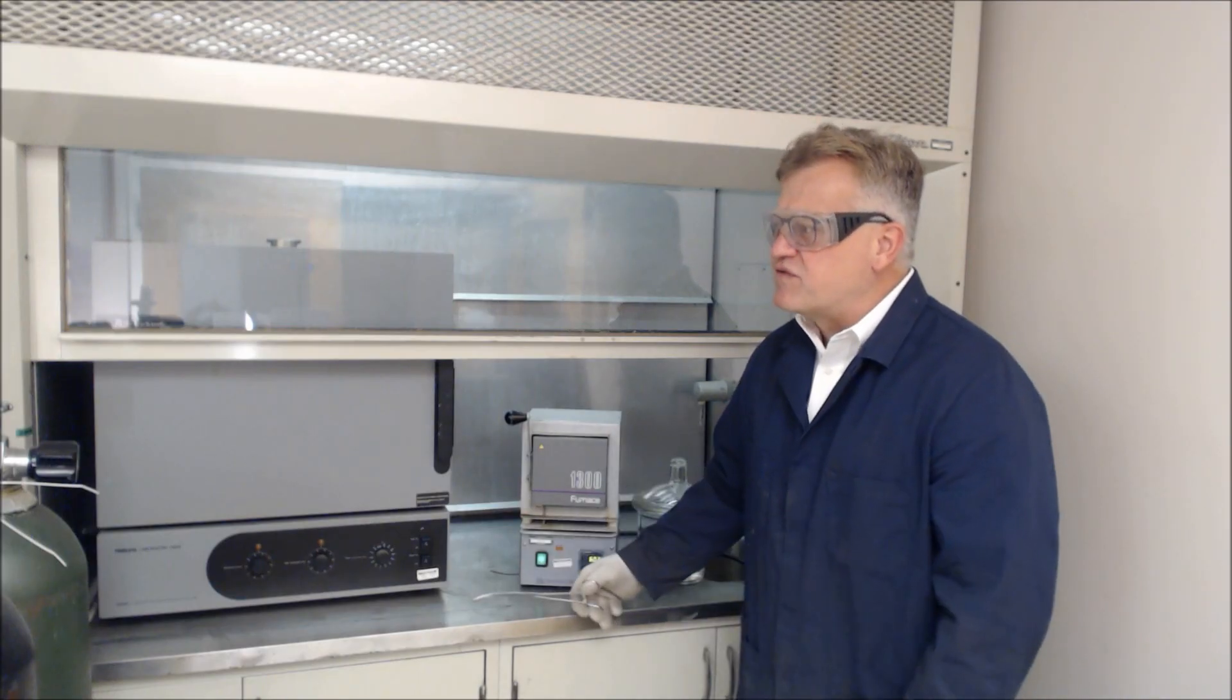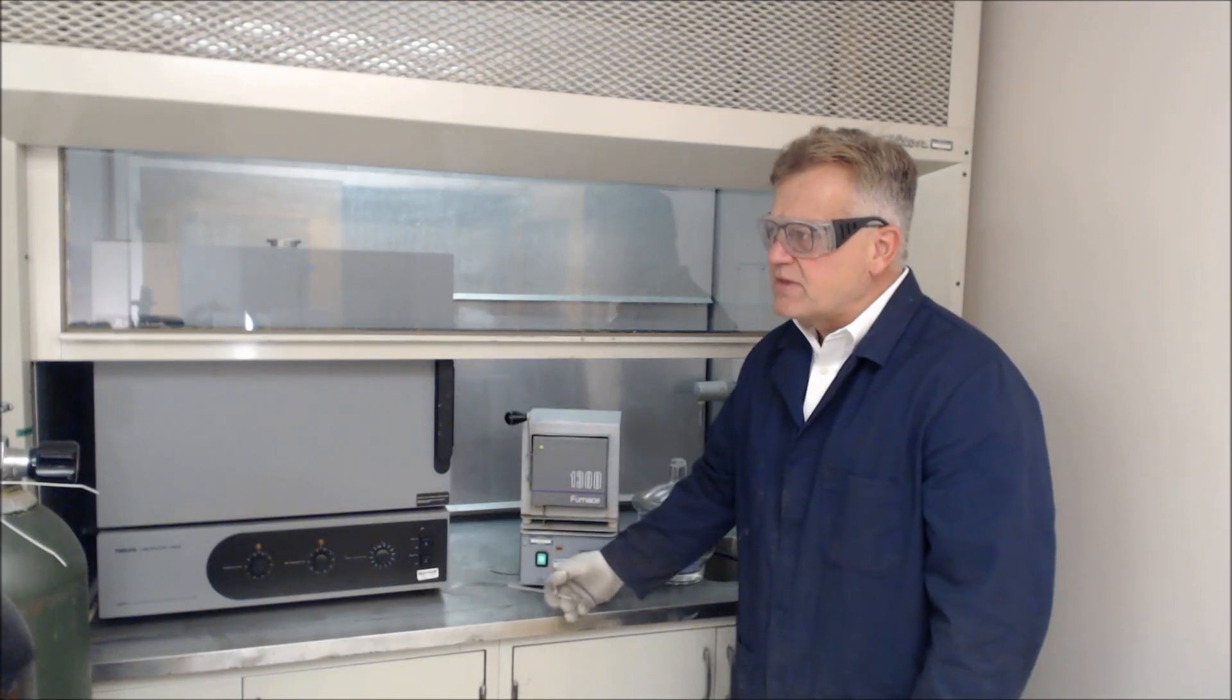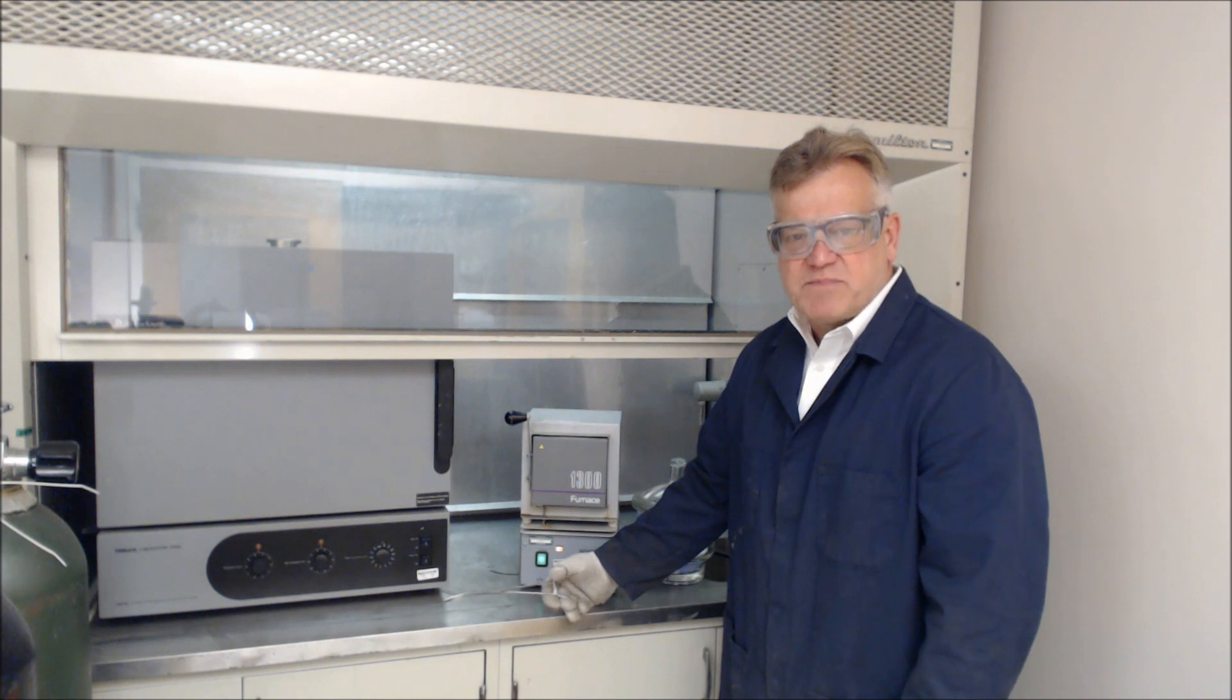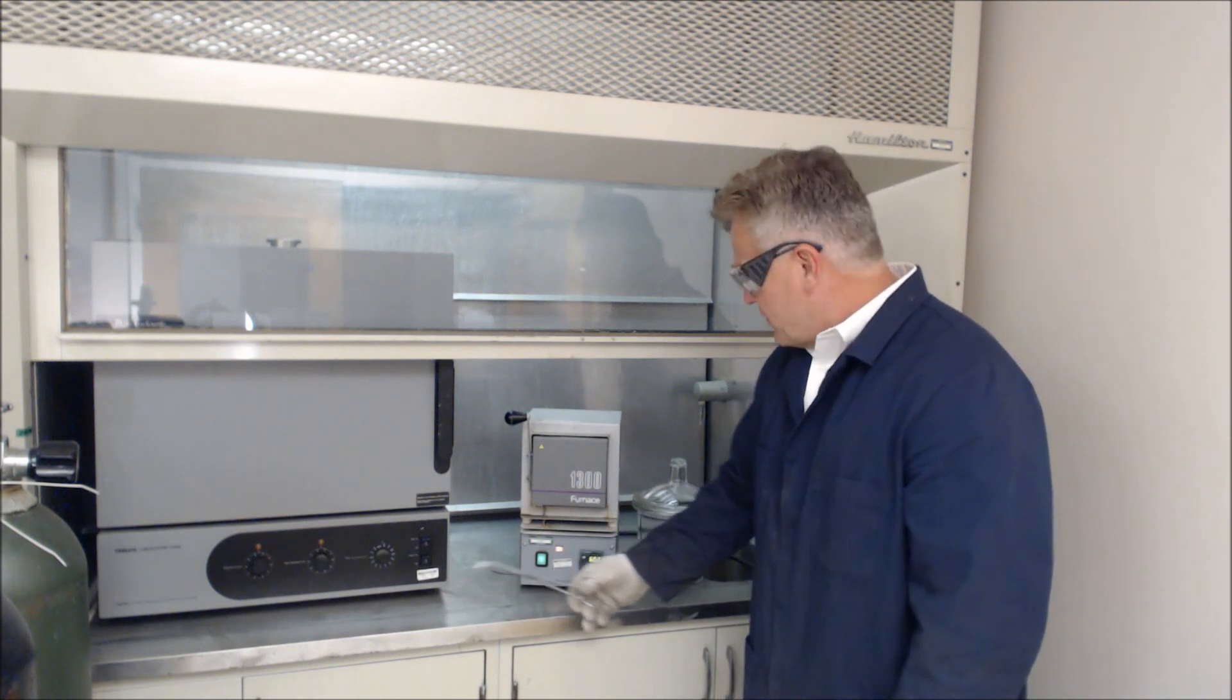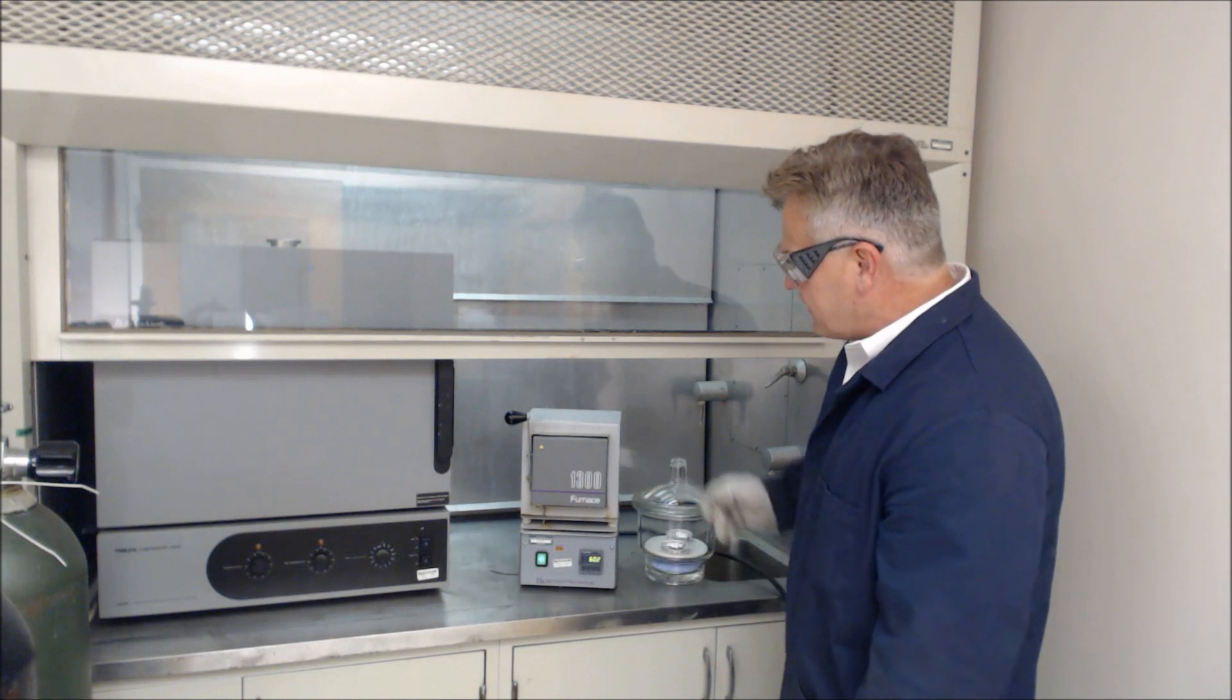We just came from the analytical balance weighing the specimens out. We brought the specimens over in the desiccator.